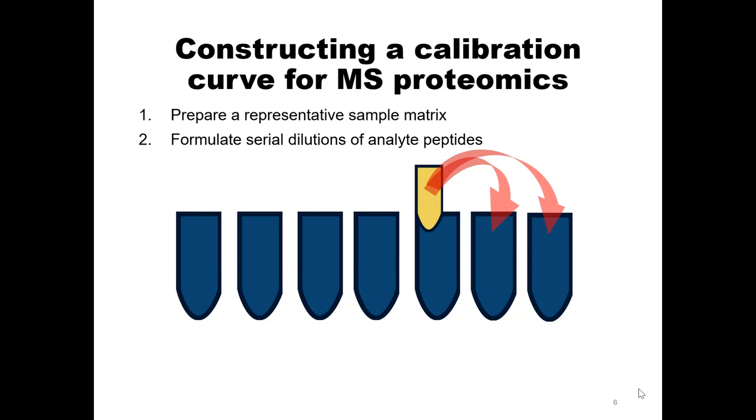I think most typically it's different concentrations of heavy peptides because you're doing all these validation experiments and you have some candidate target list of peptides that you have ordered synthetics for. Yeah, dilution curve. You can definitely think of it as a dilution curve. Any more questions? If you've never done one of these before, I think it is pretty confusing, so I would expect questions if you haven't done one before.